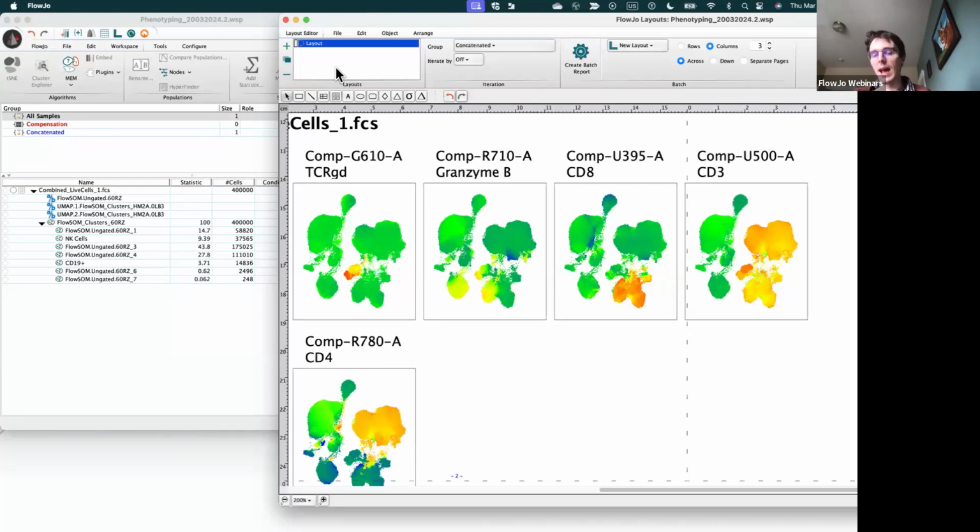But after doing the clustering, you can split the concatenated sample apart based on its patient ID, and I have included some of those types of annotation in it. We could then use that to split apart the concatenated file and apply the same clusters to the multiple different patients to see the same clusters changing between patients. And again, that's in our clustering webinar, which you can go check out, but we're not going to look at too much detail today.